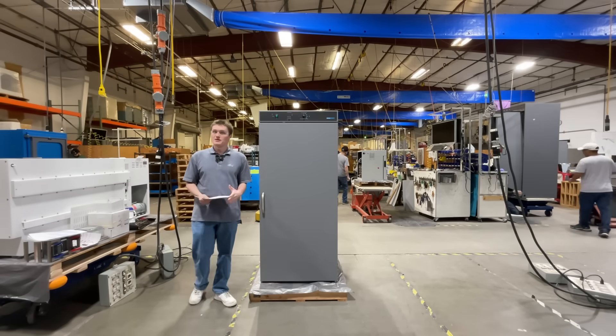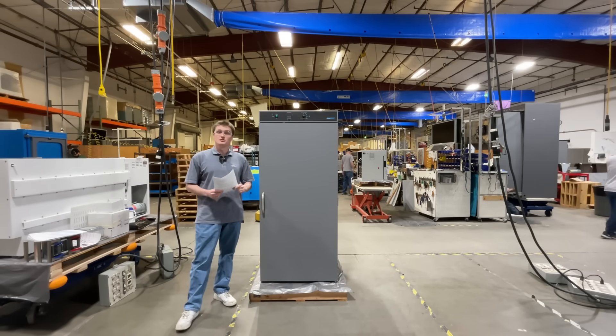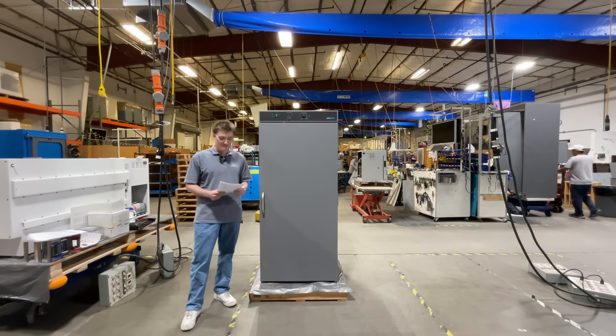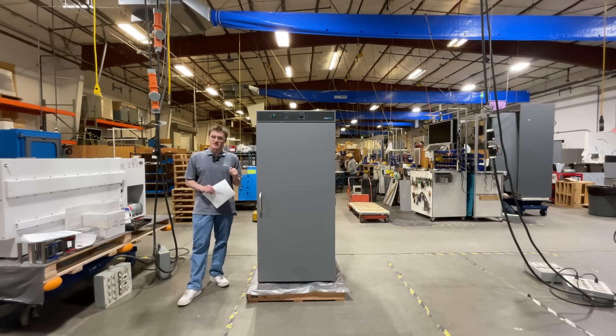Hello, my name is Corv Sankstake and I'm a design engineer here at Shelby Manufacturing. Today, we're going to be introducing the SRI 20P Refrigerated Peltier Incubator. This product offers advanced technology and unmatched performance for temperature-sensitive research and testing.